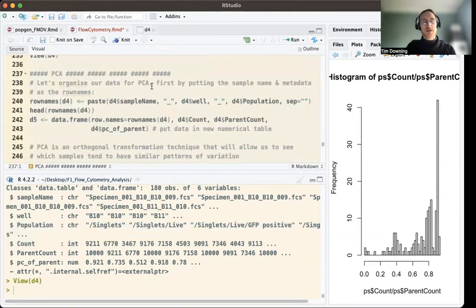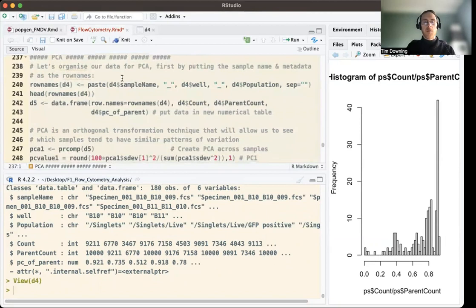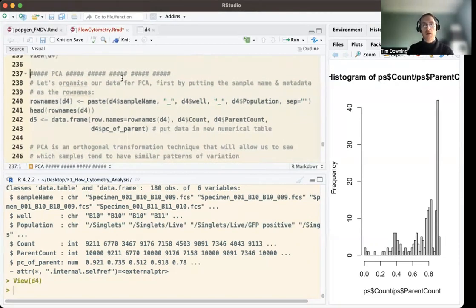We can also visualize this data using PCA. So most of the variation we'll see will be organized across different eigenvalues, PC1, 2, 3, 4, 5, and so on. And we'll use the eigenvectors then to plot the coordinates on a plot to visualize it.